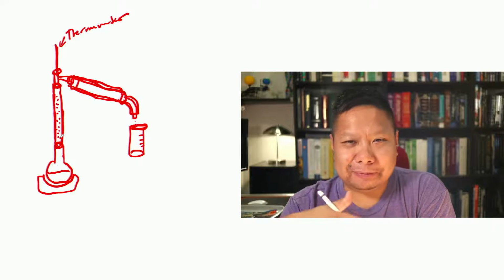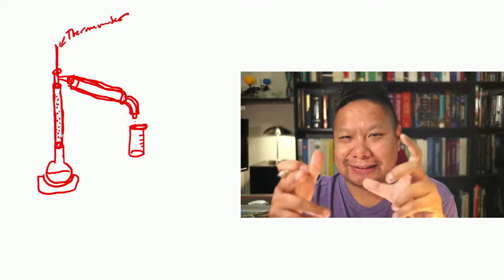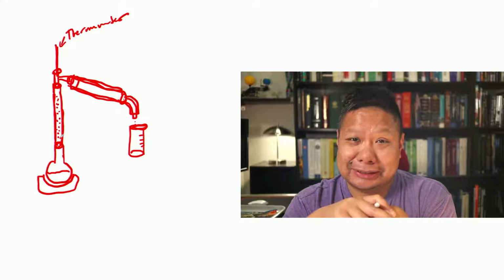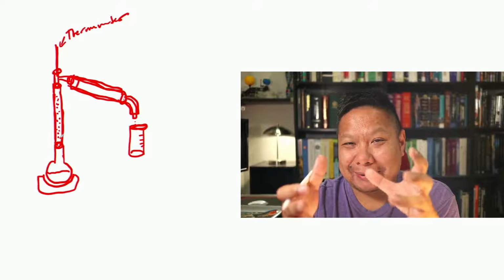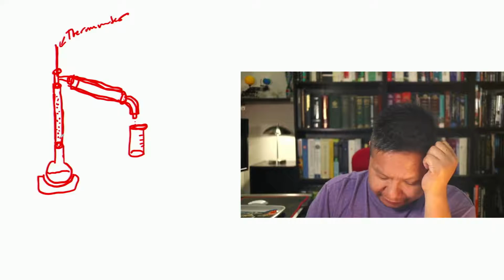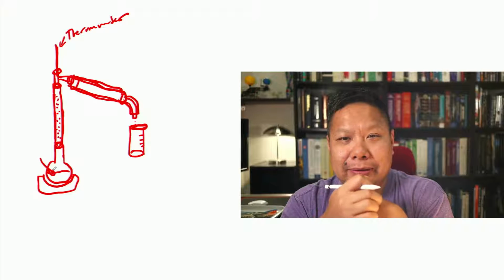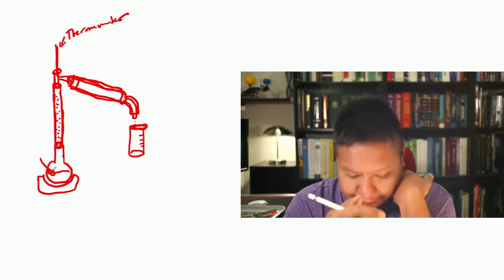Well, after you ferment it for a little while, you get this mixture of nastiness in there, and it makes you feel kind of sick because it looks nasty, but it smells like beer. And then I would take that mixture and pour it all into a distillation apparatus like this one, right? That whole mash into there, and then I would turn on the distillation apparatus.